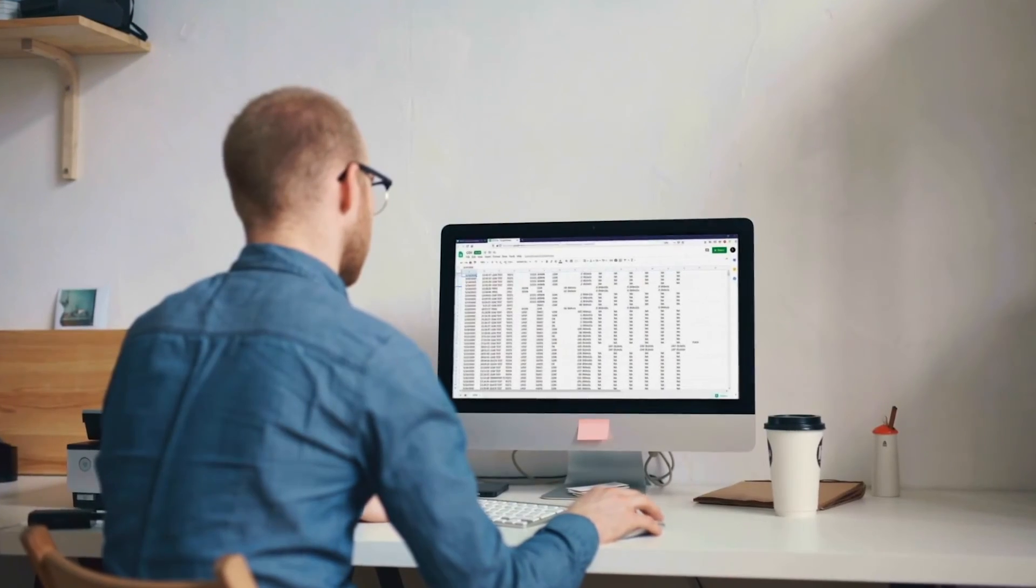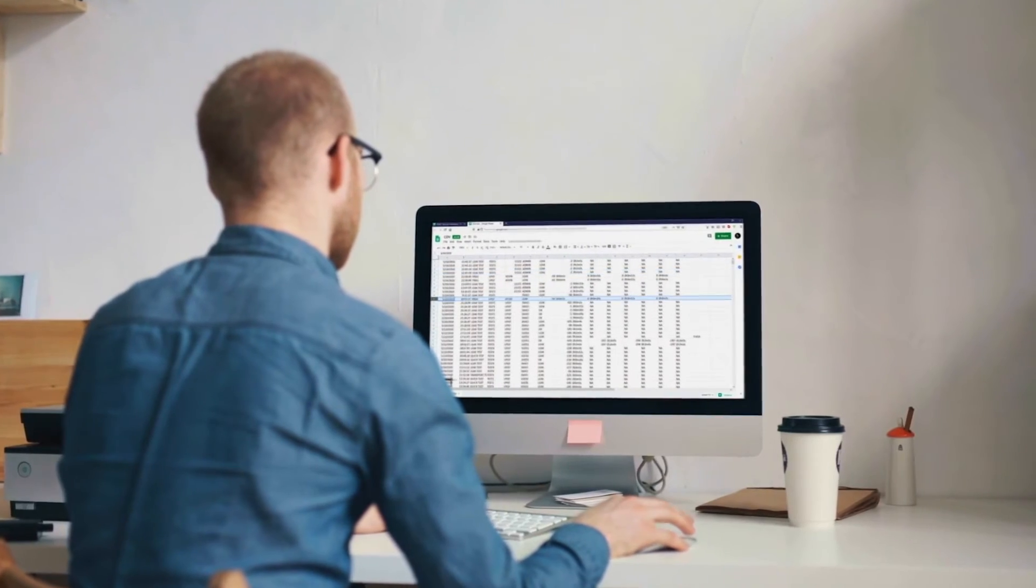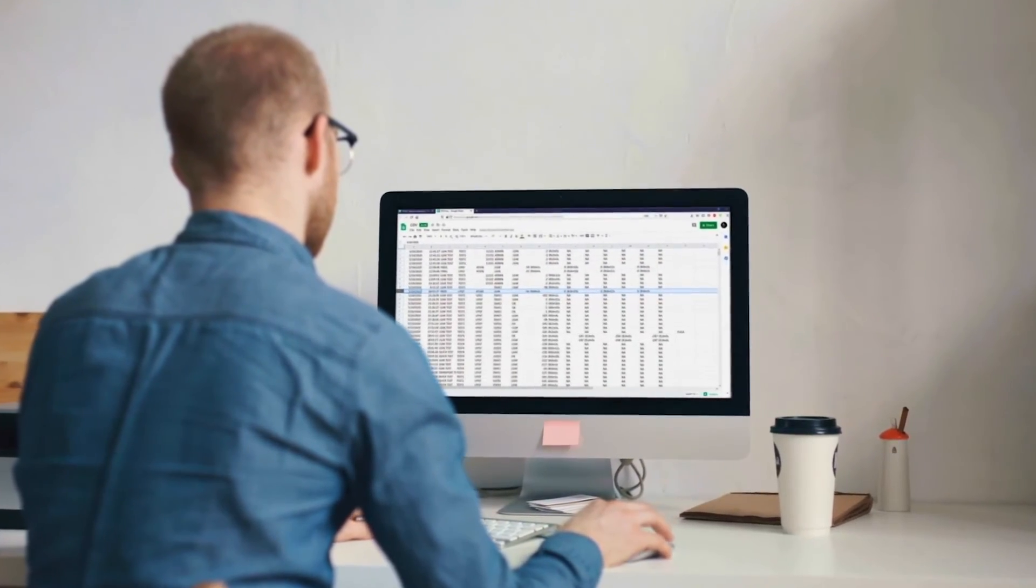At the end of each test, Orion will store the results in a spreadsheet and file them directly into the SD card.